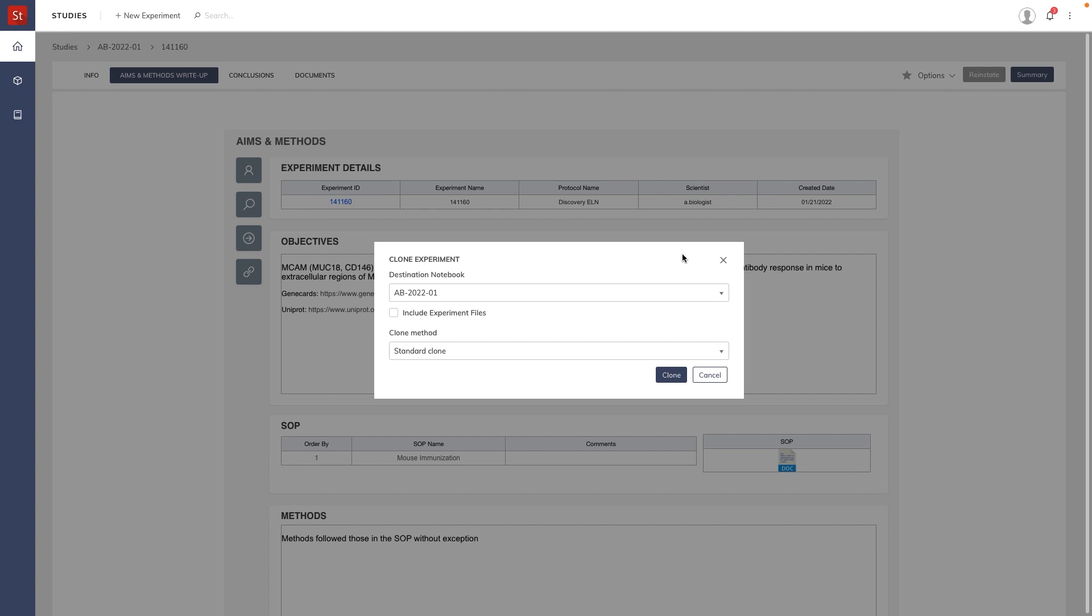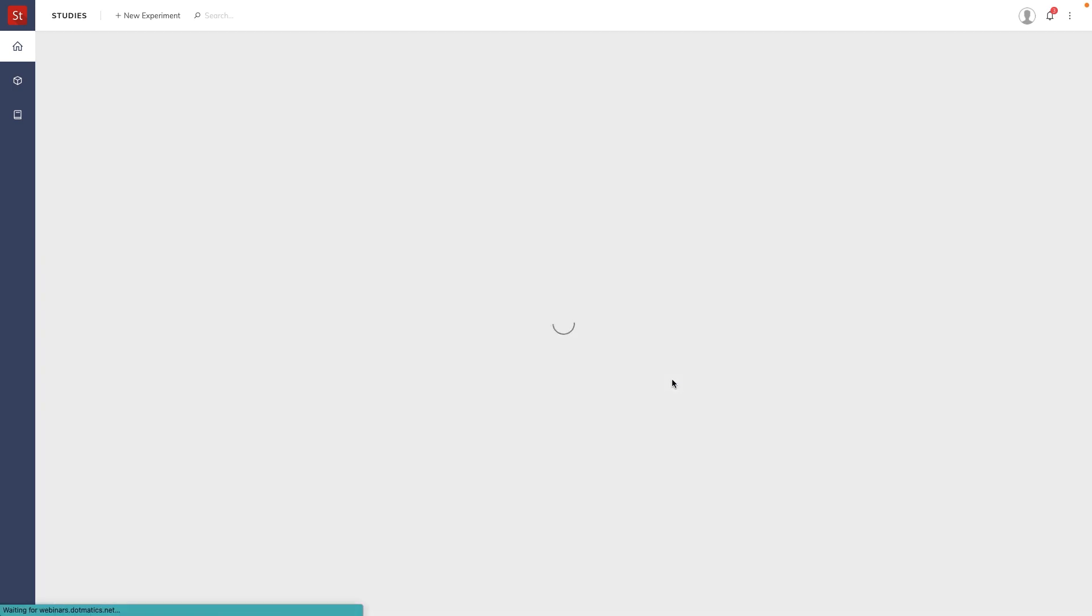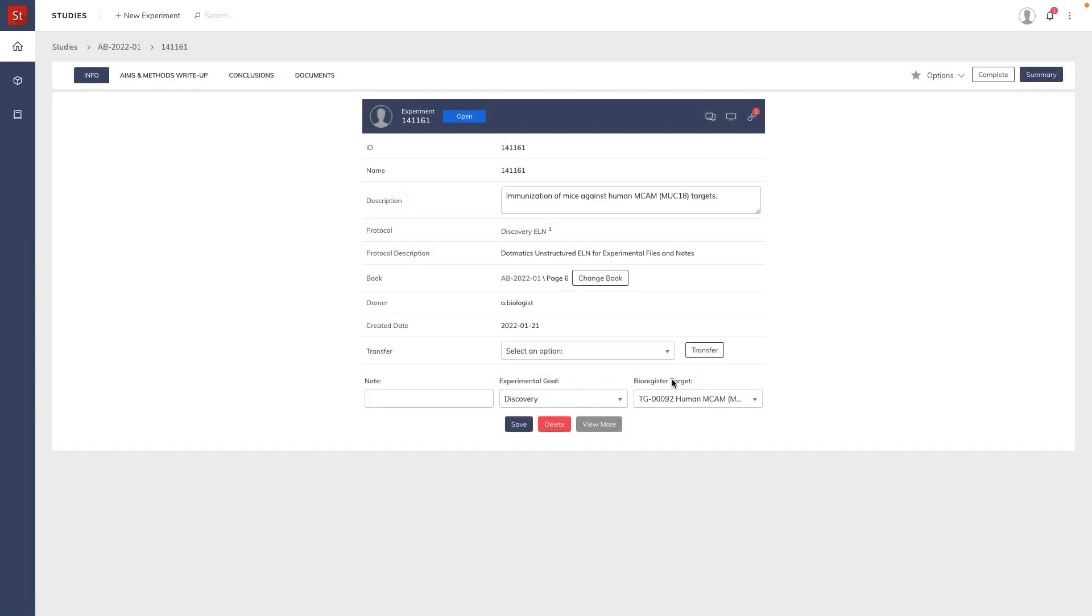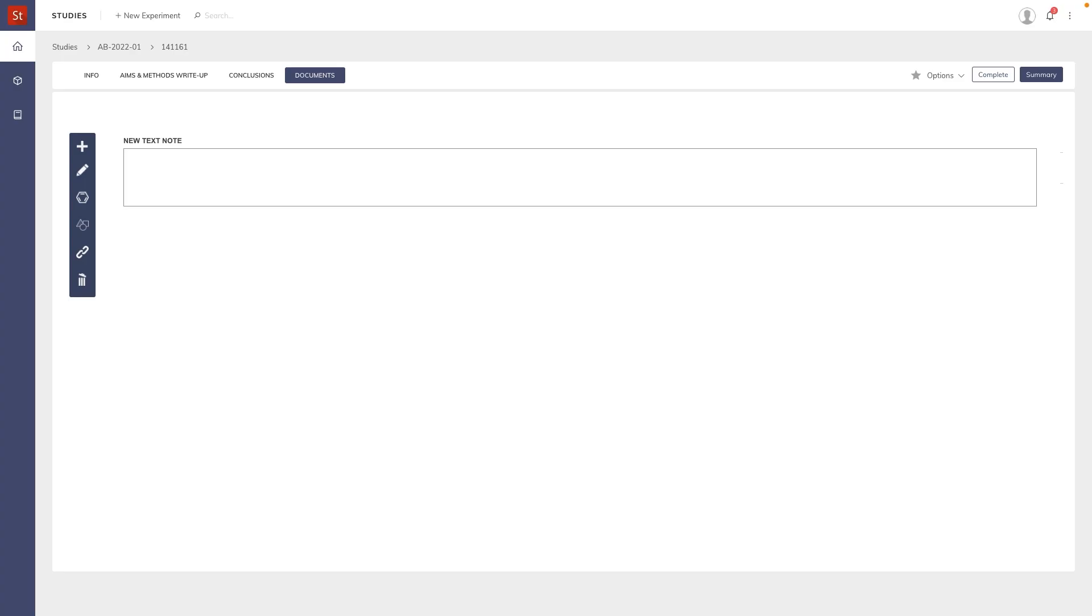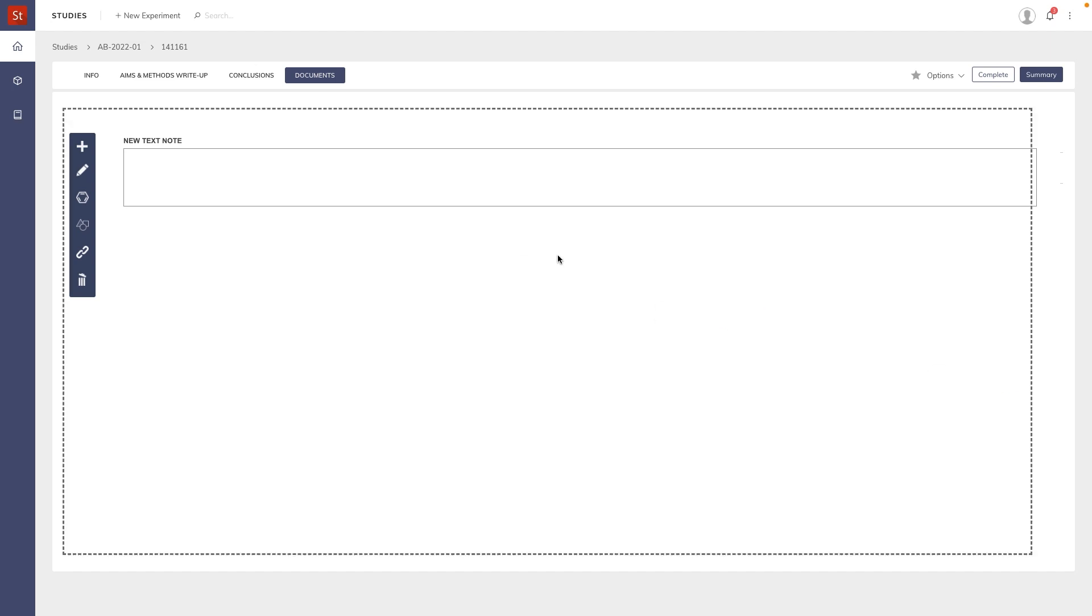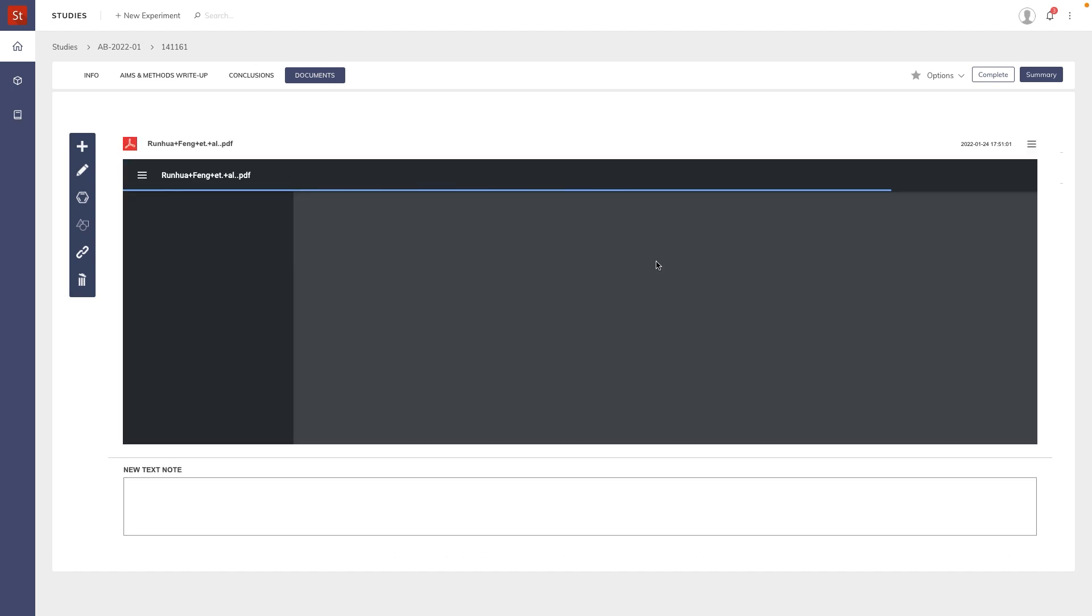And then add some documents to it. So once cloned, we navigate to the documents section. We can browse for documents or simply drag them in. So here I've added a PDF.